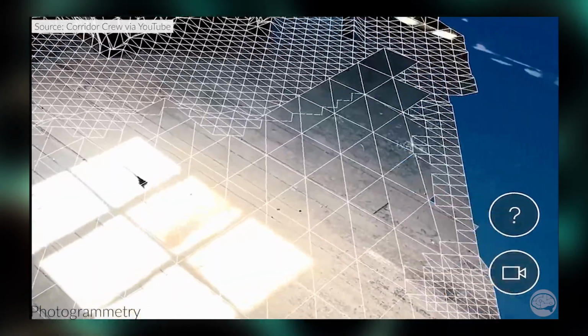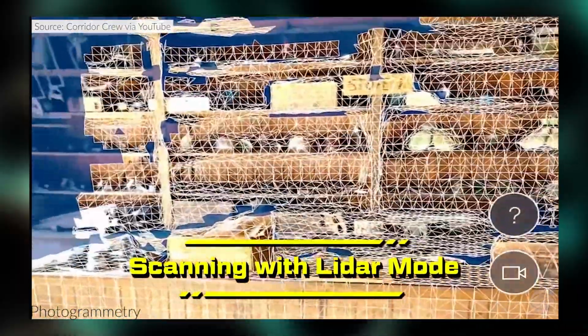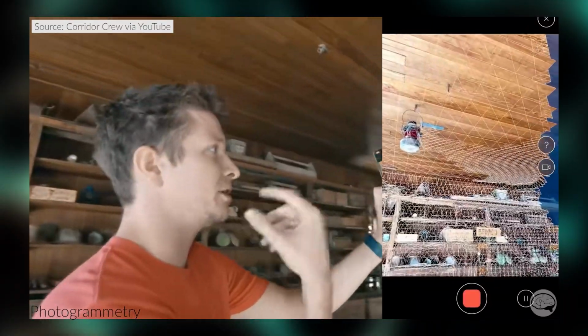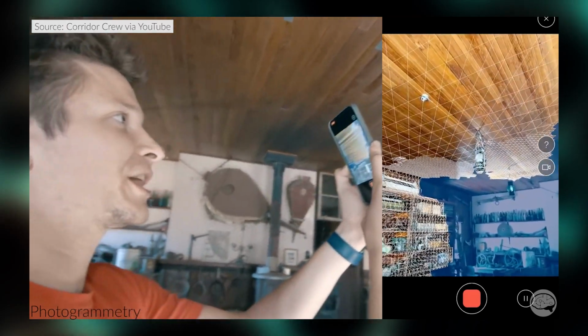Photogrammetry. Most of you are likely familiar with what photogrammetry is. This involves moving a camera around an object or even around a room, and the software will construct a wireframe model of what the structure looks like and apply images to the surface. People have been saying that this is the next big thing in SEMs for a while now, but I haven't seen it yet.